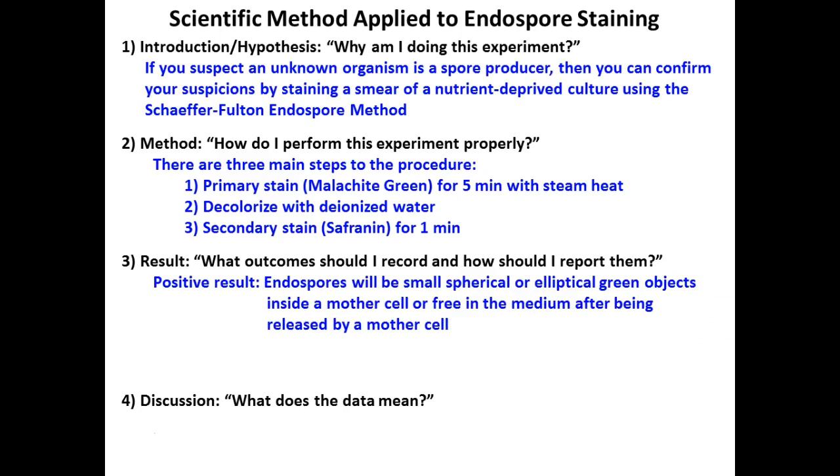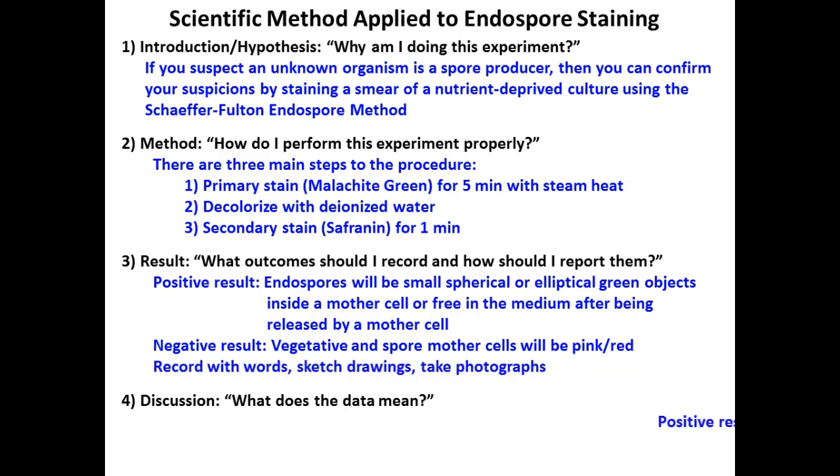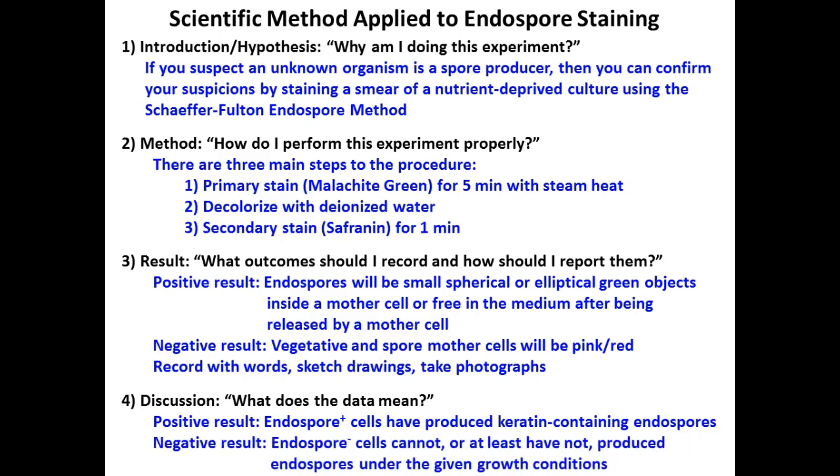So again, for spore positive, you're going to see the actual spores, whether they're inside or outside of the cells, a greenish color. The cells should be red. Just because we're saying negative doesn't definitively say it's not a spore producer. Record your results on your sheets.